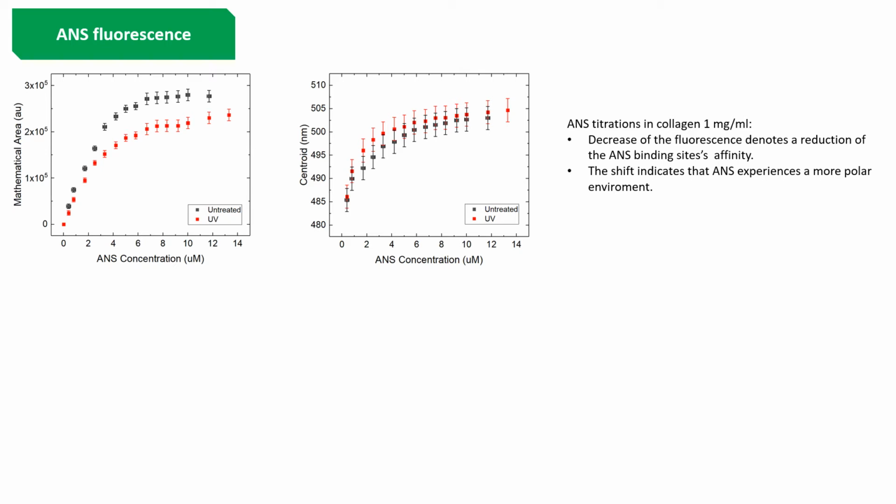Also, there is a redshift for both samples that indicates that ANS experiences a more polar environment with the increase of ANS concentration.